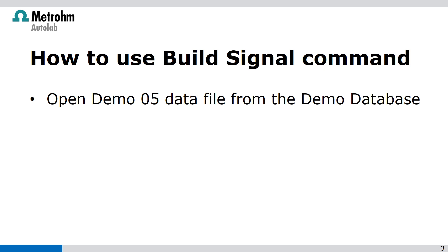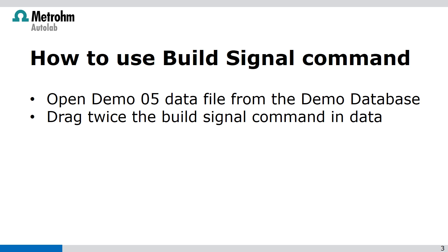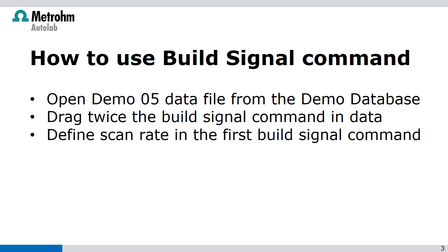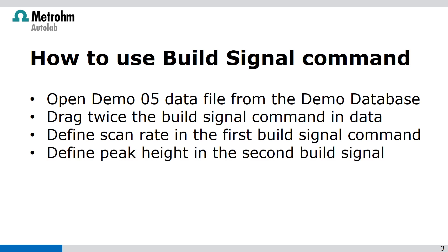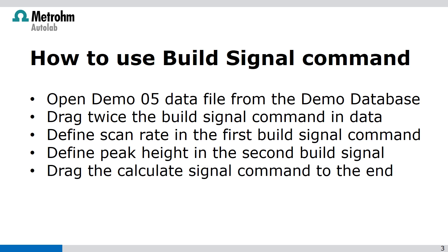First, we have to open demo05 from the demo database, then drag twice the build signal command in the data. In the first build signal command we are going to define the scan rate, in the second build signal command we will define the peak height. Then we drag the calculate signal command to the end to calculate the square root over the scan rate.